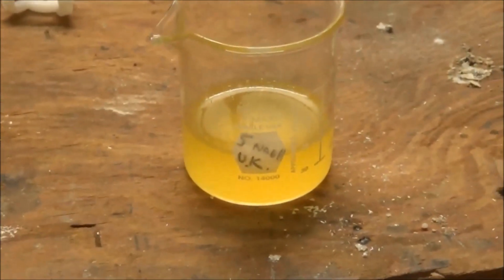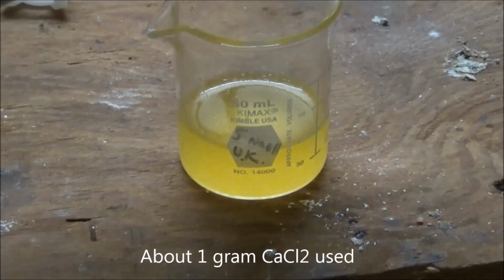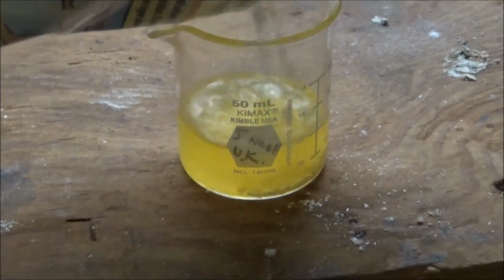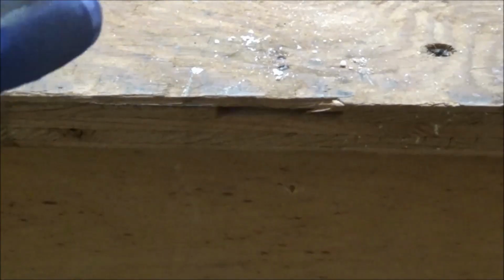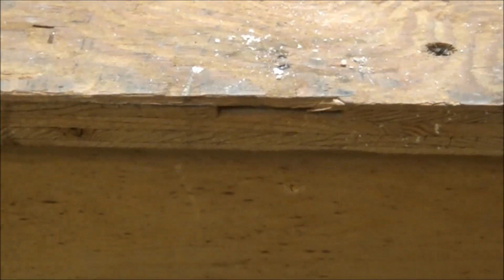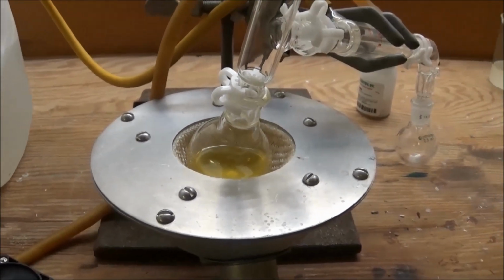The resulting toluene solution was about 20 milliliters in volume and cloudy, so I added some calcium chloride pellets to dry it. It did its job very well, so I decanted the toluene into a flask for distillation. Next, the toluene was distilled off.